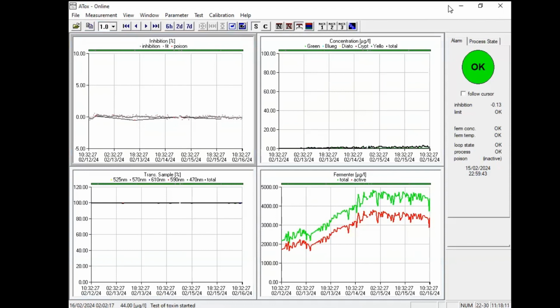At the end, the mechanical cleaning with a piston is still activated. Here you see in the parameter set every 10th cycle. That means every 5 hours. I understand. Okay. The other question about the reference poison measurement: is it an option or is it already in every unit?